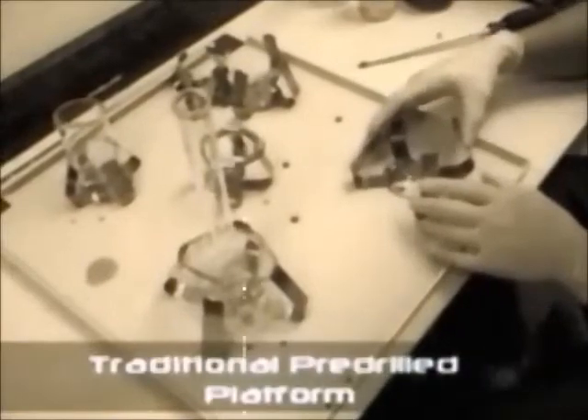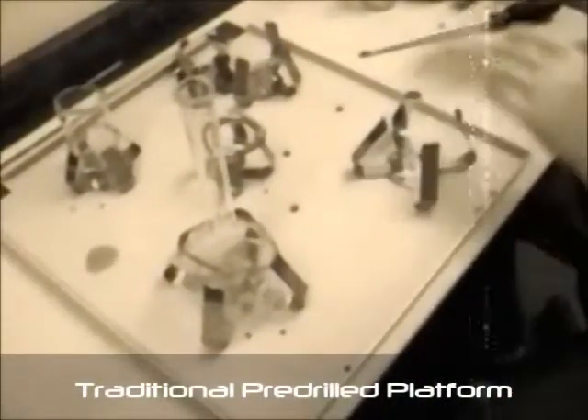Gone are the days of searching for the toolbox when changing the flask clamps on your old-fashioned, pre-drilled shaking platform. The tedious process of lining up a series of holes, locating the correct screw size, and tightening 4 screws per clamp is a thing of the past.